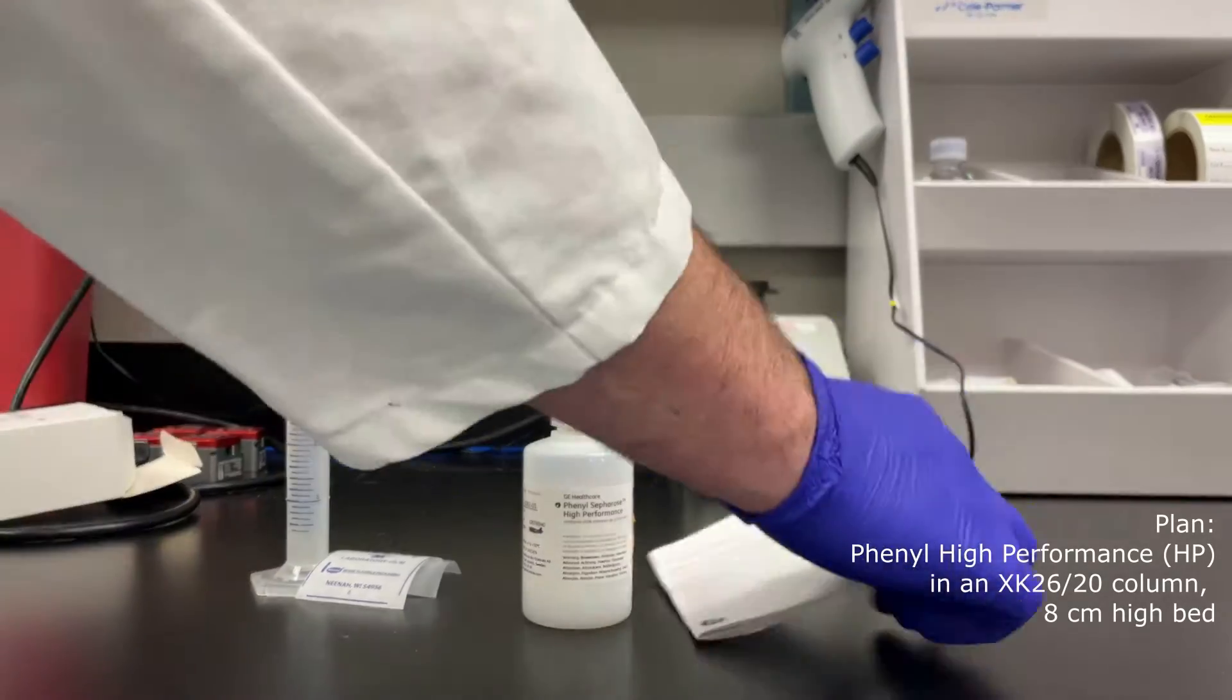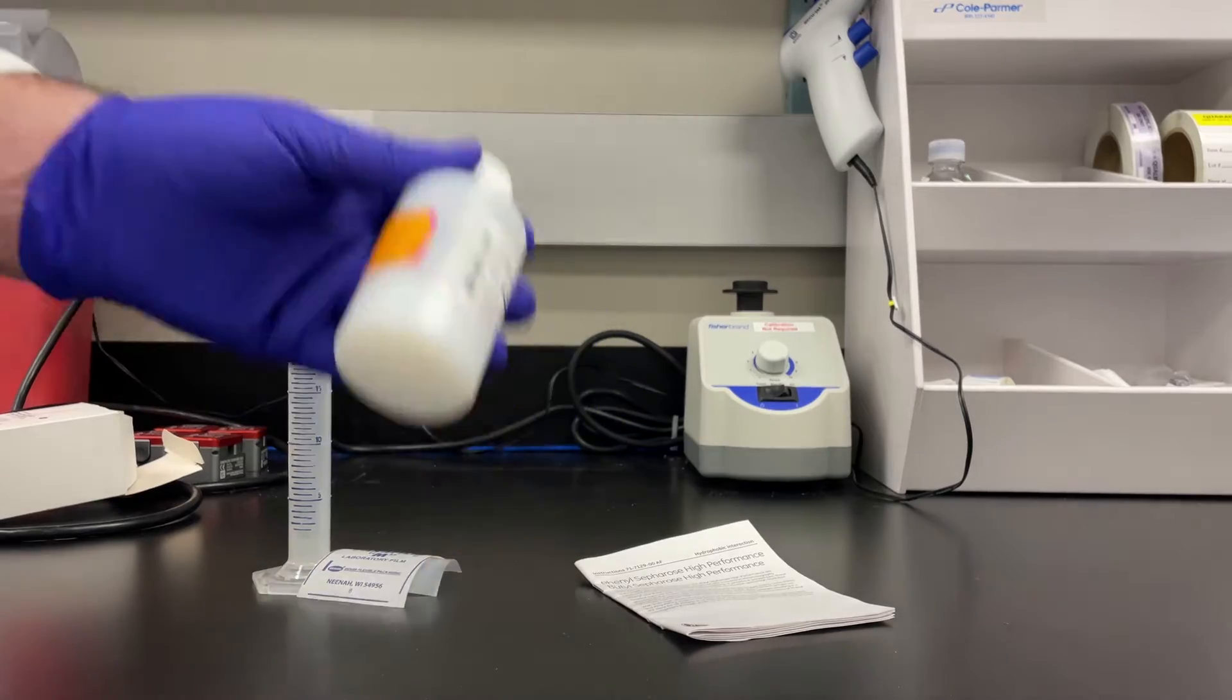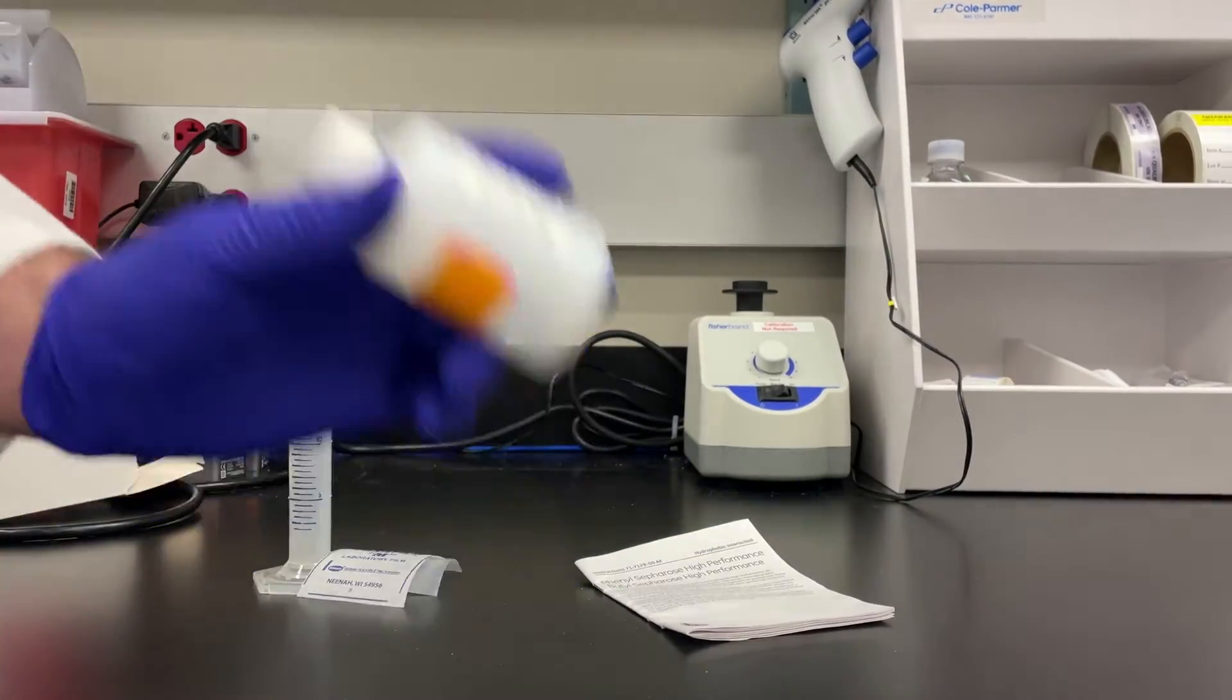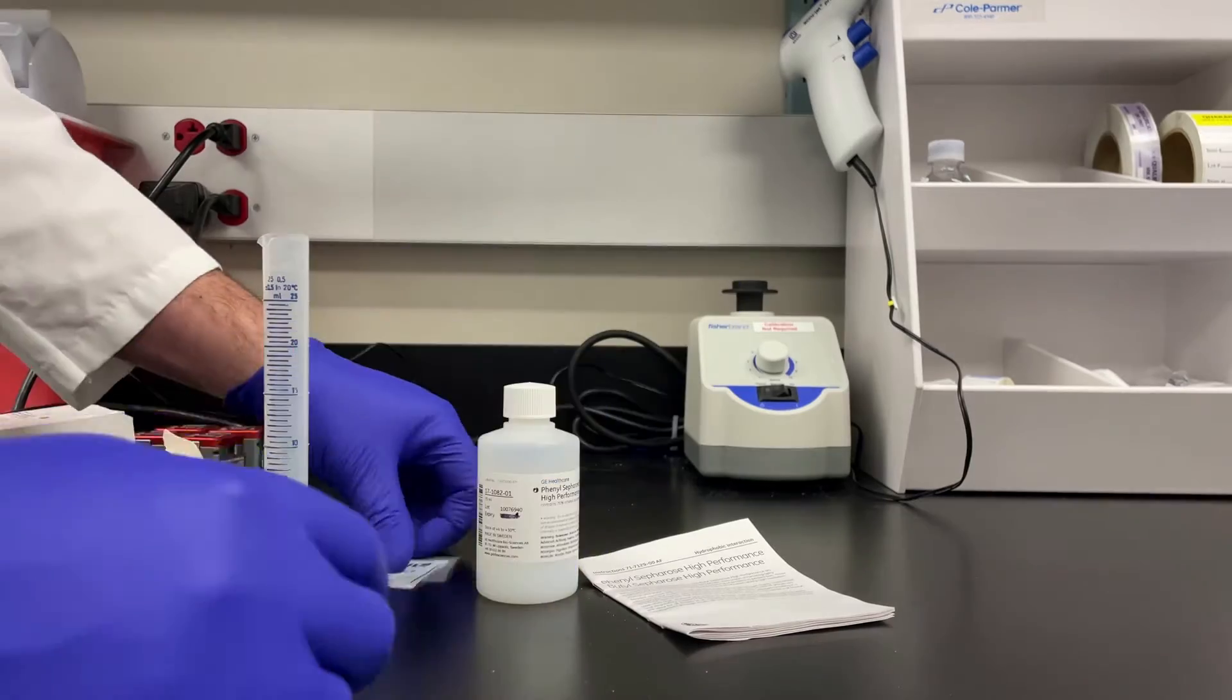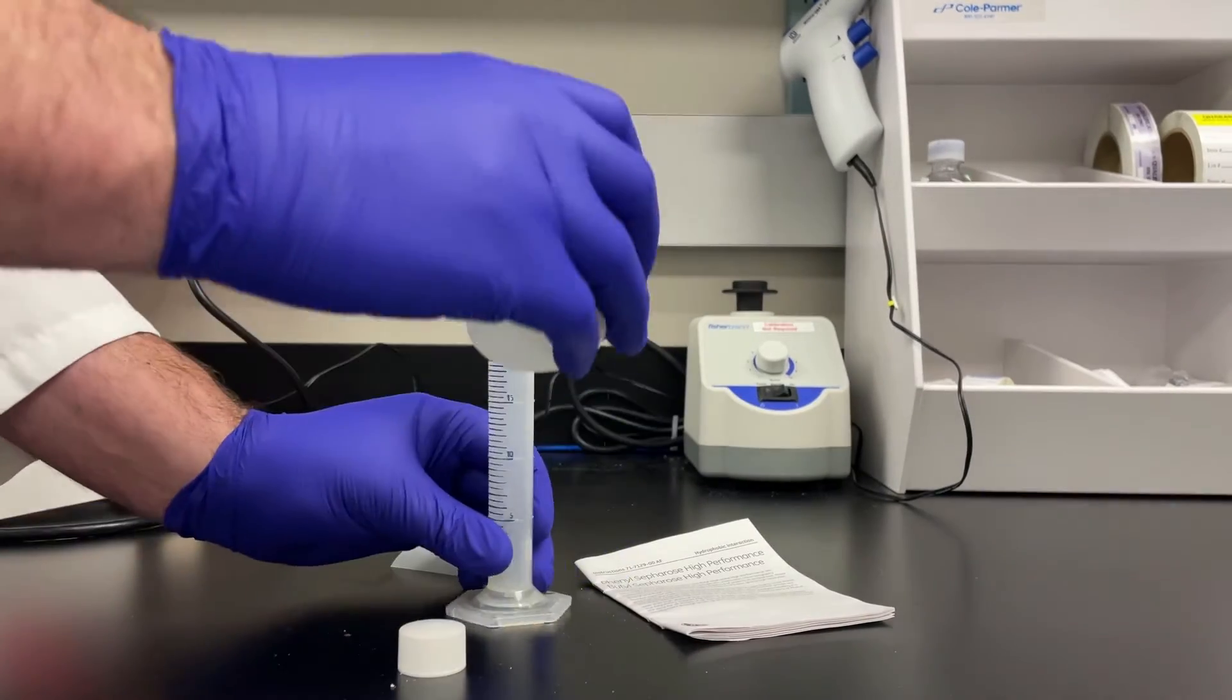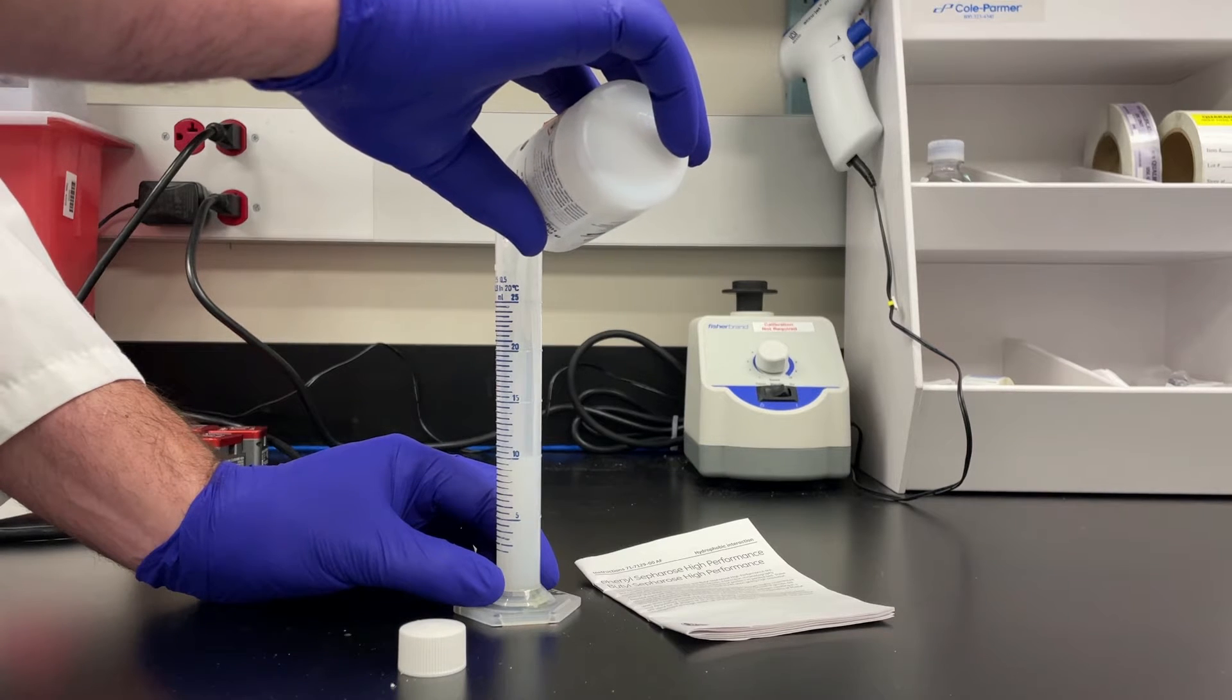This is FEDL HP chromatography resin. We're going to start by measuring the slurry content of what's in the bottle. We'll do this by resuspending the resin in the solution and then pouring it into a graduated cylinder. I'm looking for about 20 mils here, but it doesn't really matter. We're just going to divide one number by the next.